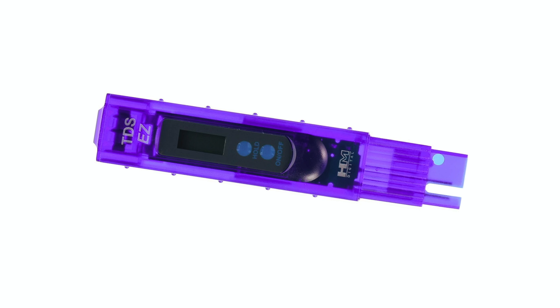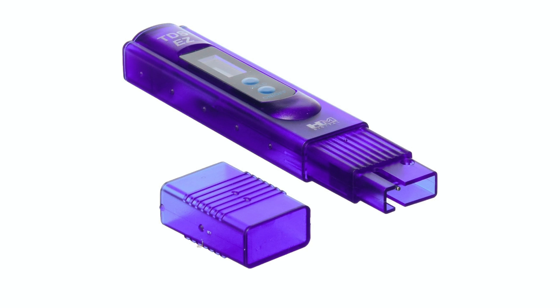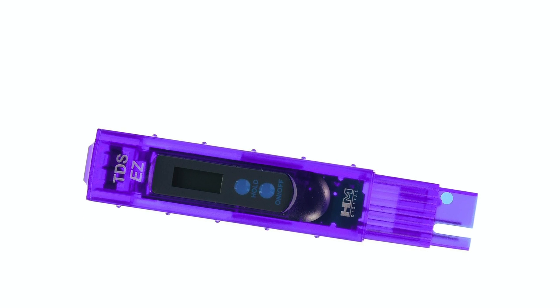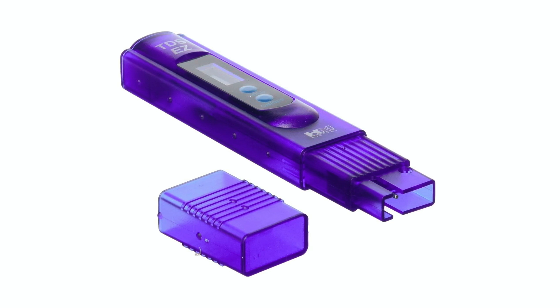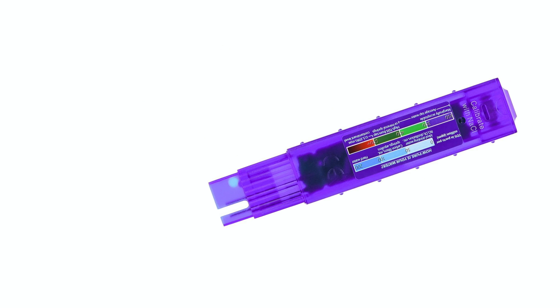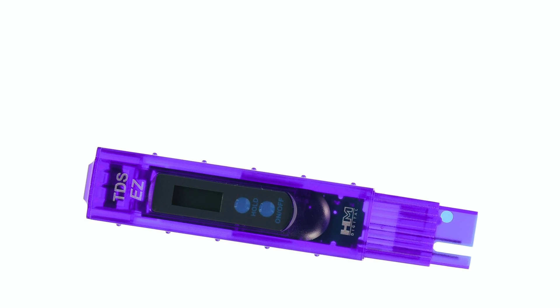For those looking for a simple, no-frills option, the HM Digital TDS EZ Water Quality TDS Tester offers straightforward functionality and is one of the most widely purchased testers on the market. Its appeal lies in its simplicity — just dip it in water, wait a few seconds, and get an instant TDS reading. With a range of 0 to 9,990 parts per million and a resolution of 1 part per million, it offers the accuracy needed for basic water testing. It includes a hold function that saves the reading and an auto-off feature to save battery life. If you need a budget-friendly and highly user-friendly model for testing drinking water or maintaining filters, the TDS EZ is a solid pick.